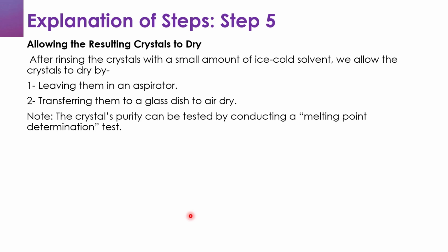So the fifth step is allowing the resulting crystal to dry. After rinsing the crystals with a small amount of ice cold solvent, we allow the crystals to dry by, one, leaving them in an aspirator, or two, by transferring them to a glass dish to air dry.